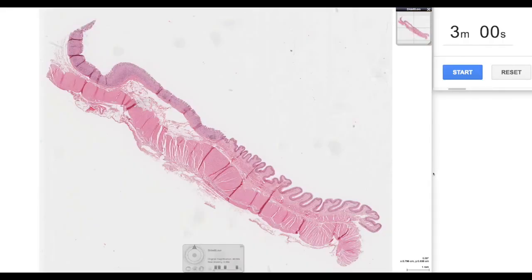Hello and welcome to this episode of Three Minute Histology with Jamie Chapman Histology. The slide we're going to be looking at today is of the cardioesophageal junction. Let's start the timer.